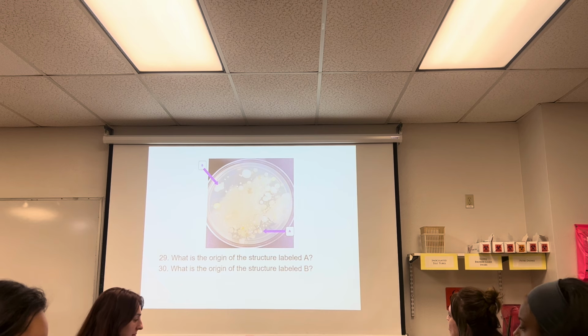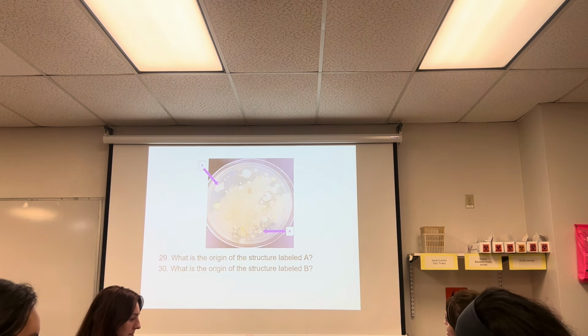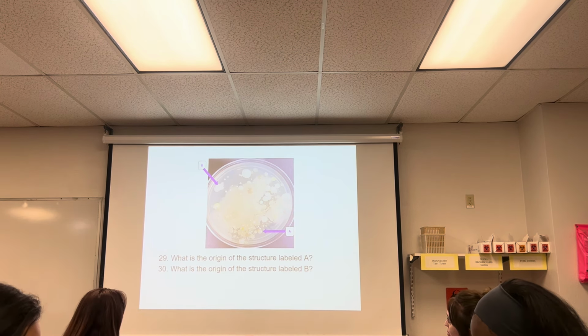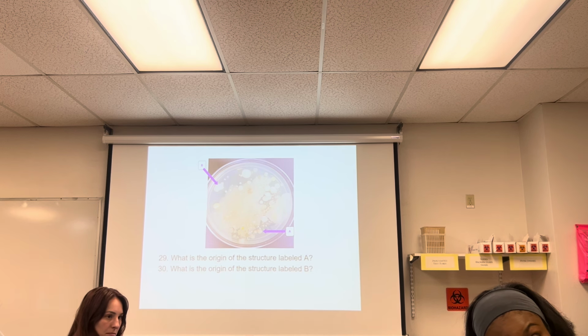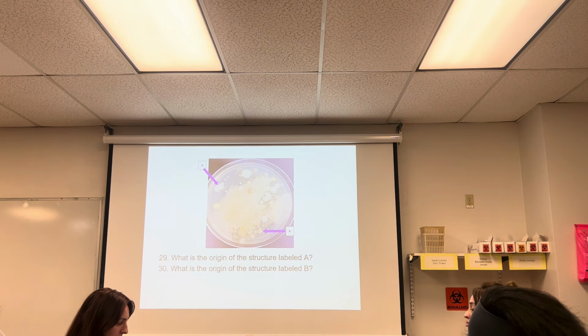Okay? So this goes back to the first and second day, right around the time of the big freeze. I said there are 3 different places where bacteria originate from. If it's really large and rough, they come from soil. If they're small to medium and brightly colored, they come from people or animals.